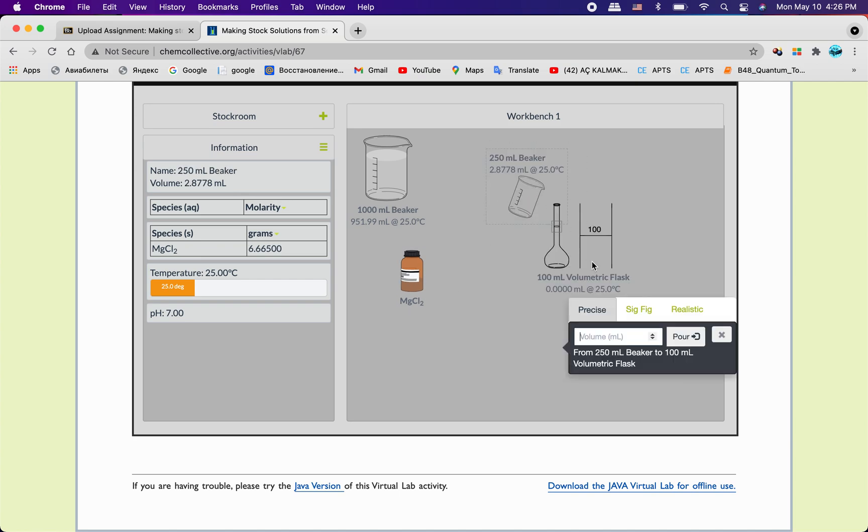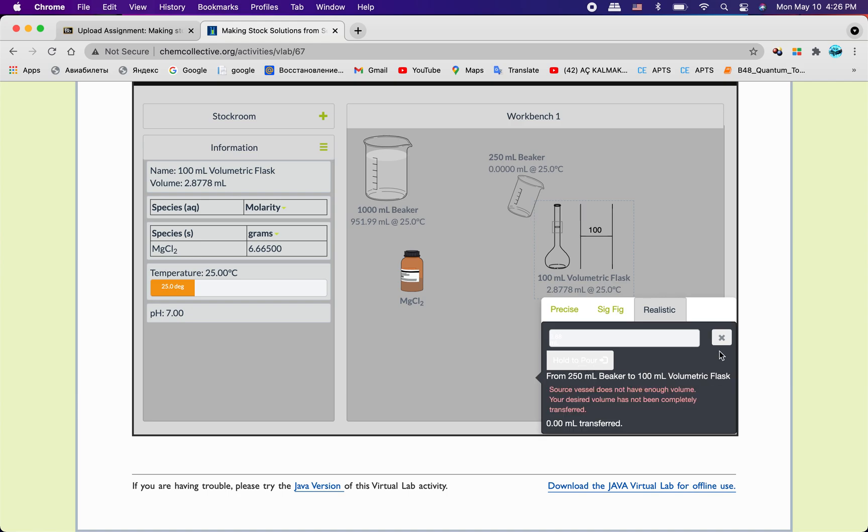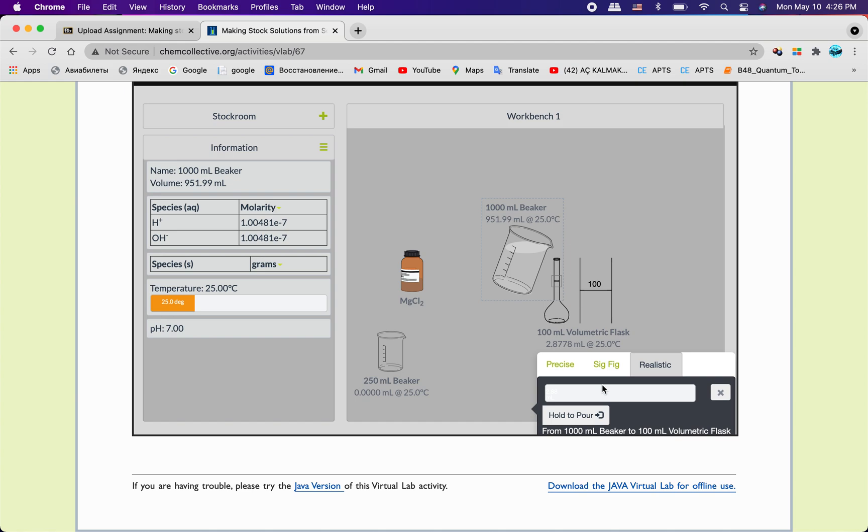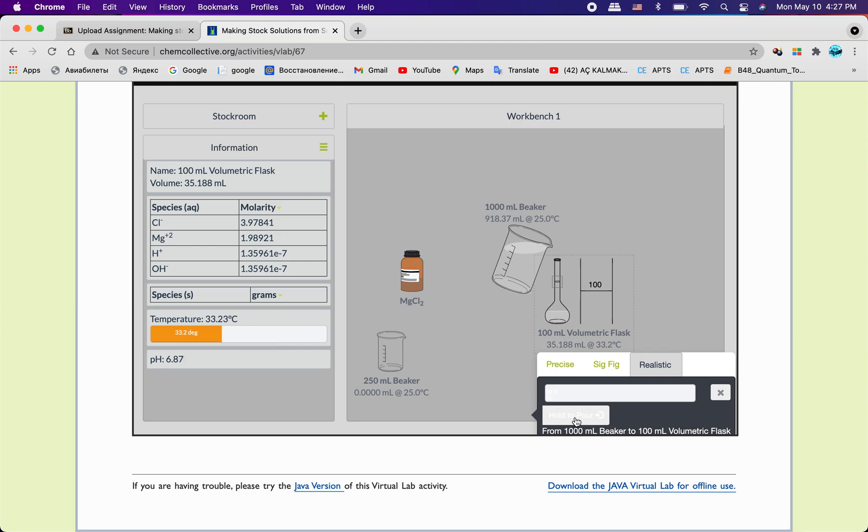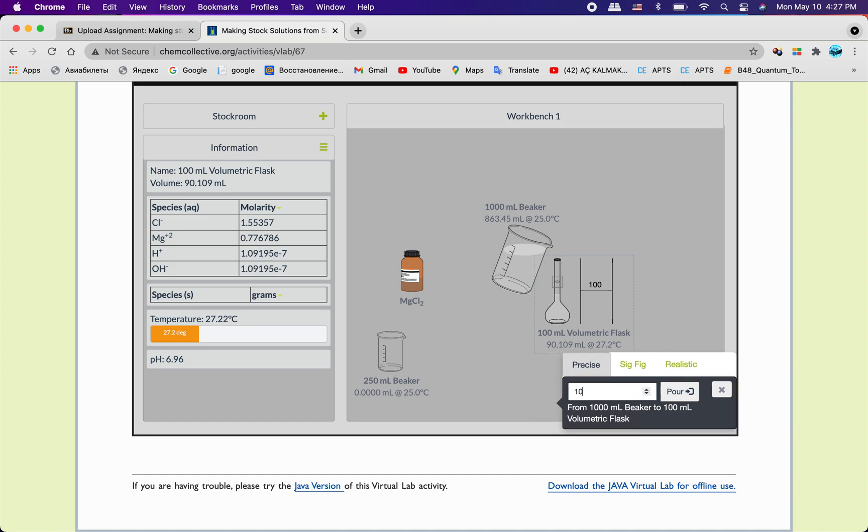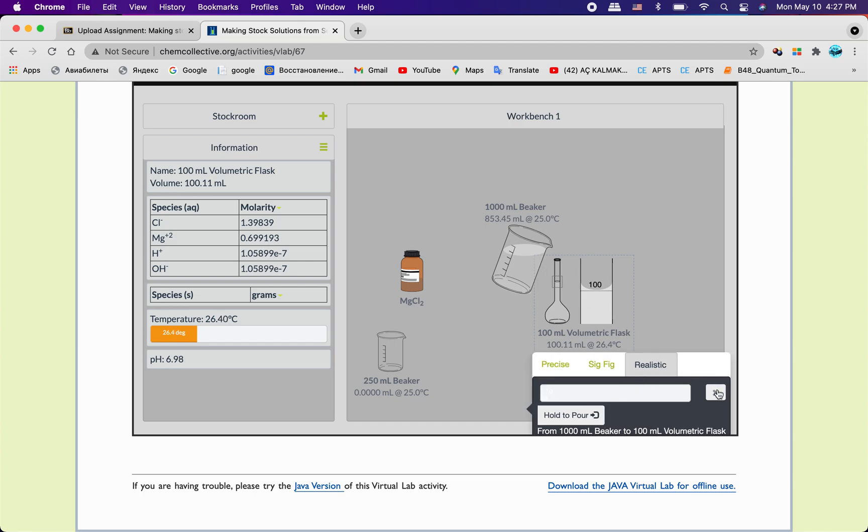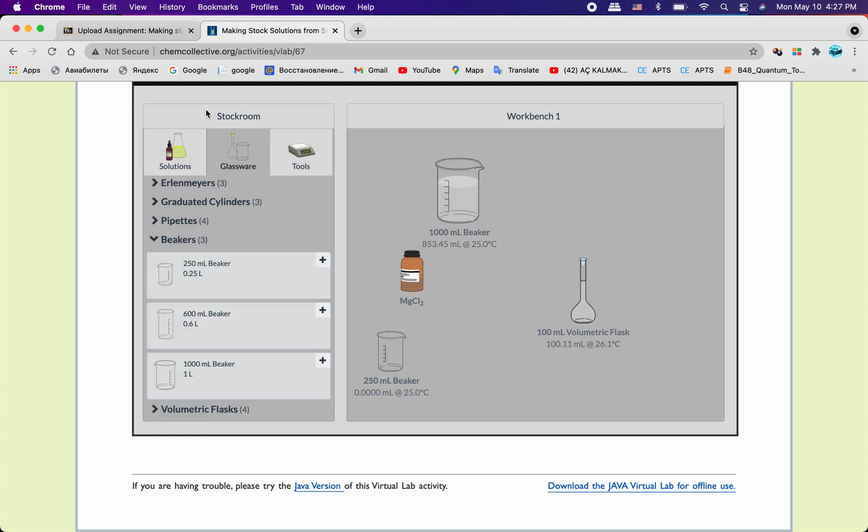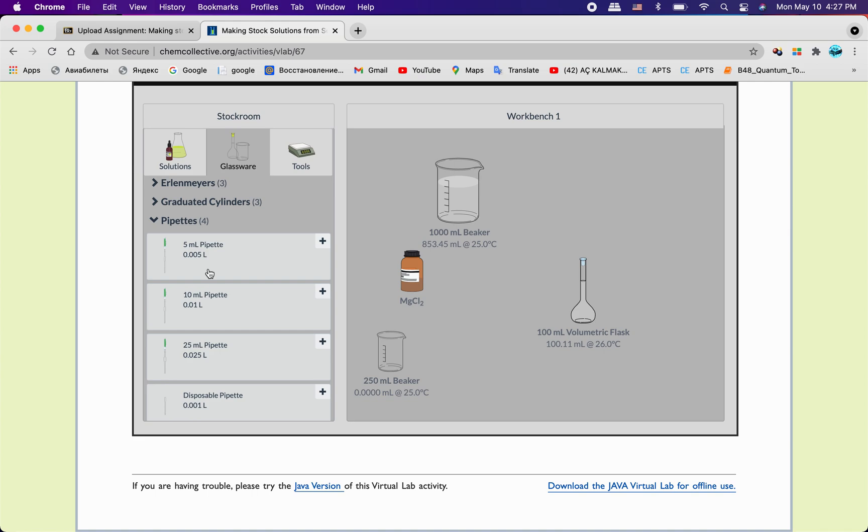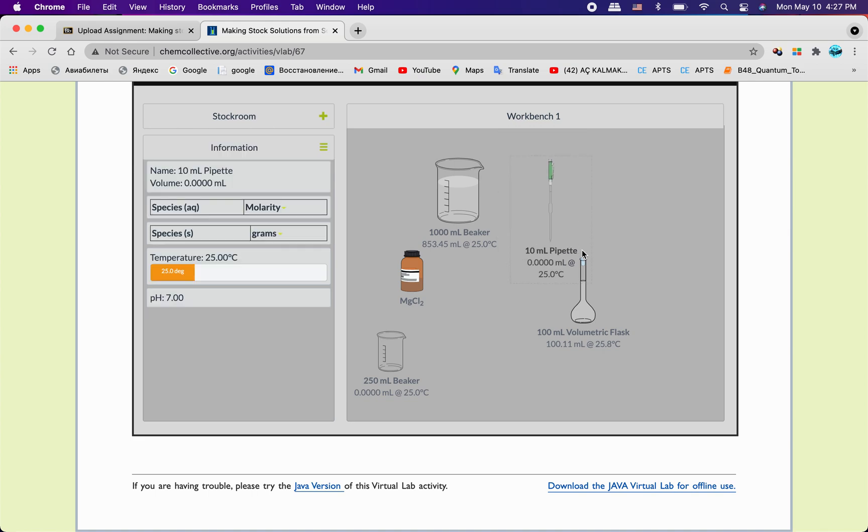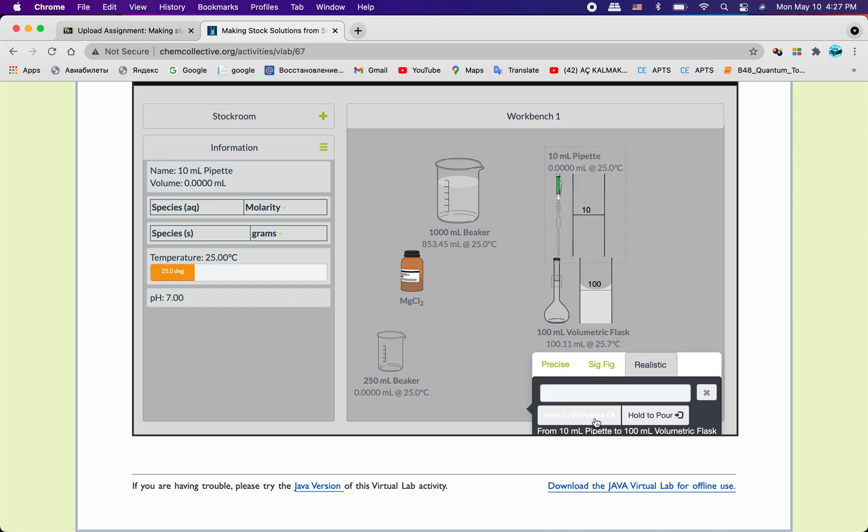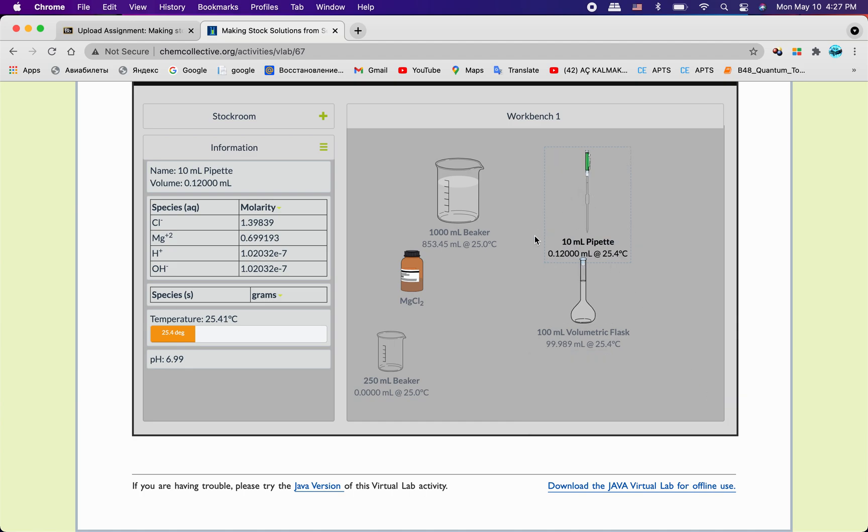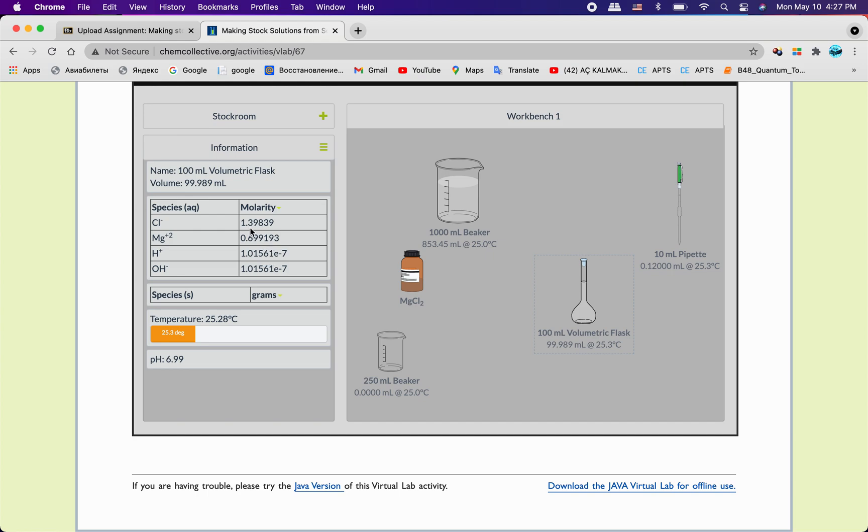I'm gonna drop it in volumetric flask. Let me do it right here and I'm gonna drop. Let me drop 10 more. Let me take some out of it with pipette. We will need this one. Here we go. And we see that we have 1.39 molarity and 0.69 magnesium.